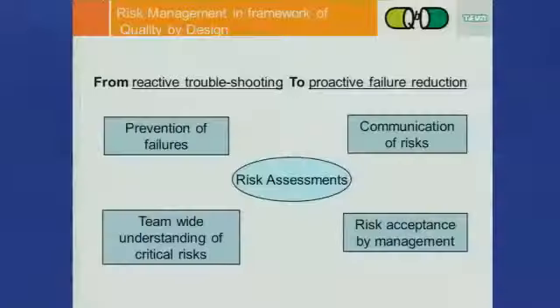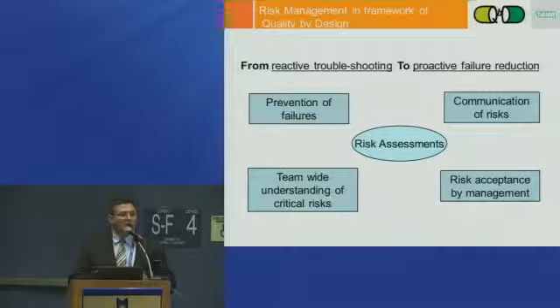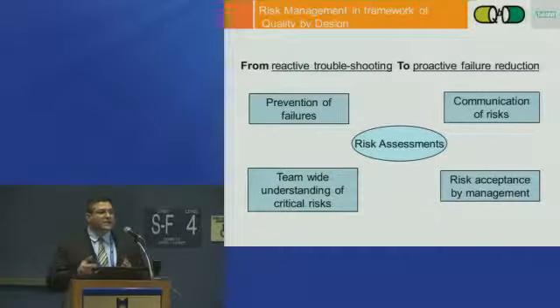All right, another thing in quality by design is a few elements. One is knowledge management. The other one is risk management. Knowledge management is all the knowledge that one would gain from method inception all the way to transfer and continual improvement. There are a variety of software packages out there that help you with knowledge management. That's not the purpose of this talk. However, it is encouraged to have some type of systematic way to retain the knowledge and leverage it.